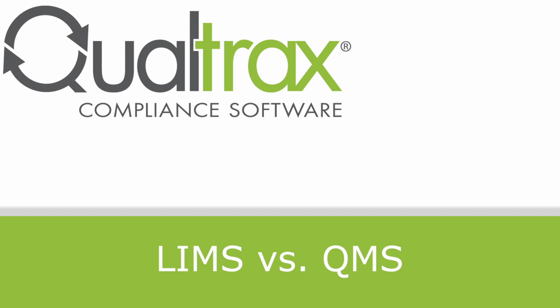Hello everyone. Today we're going to talk about the difference between a LIMS system and a QMS. So what are they and do you need both? Let us start with a description of the two systems.